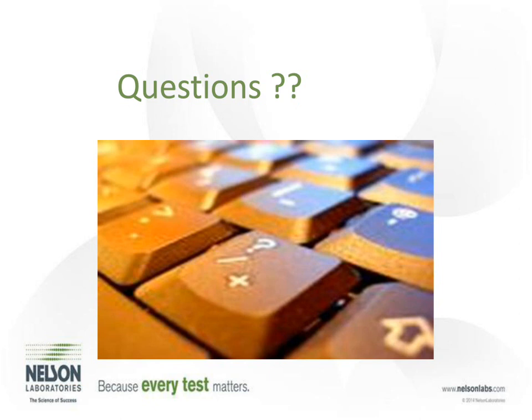10993-5 has recommended quantitative method instead of grades. Have you conducted comparison studies, which is more sensitive? Yeah, and like I mentioned, we haven't done it internally, but I know at the ISO we've had a lot of discussions and there's been some work done on the difference in sensitivity, and the MTT has shown to be more sensitive. In the studies that were shown, if you do a recovery phase on those cells, it tends to get it a little bit more to the sensitivity level of a cytotox test, but there's still some questions about how sensitive that test is compared to the MEM and the benefits of using it.